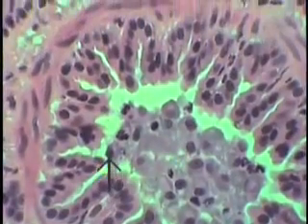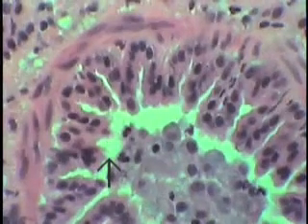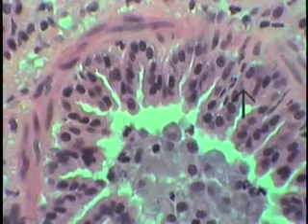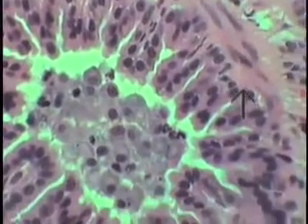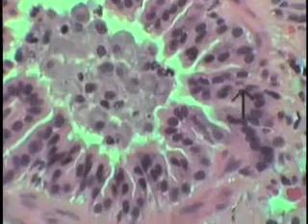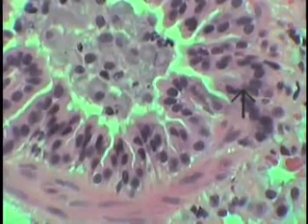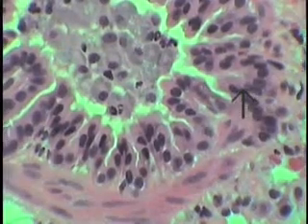No goblet cells are present in this particular case, so it's far enough down so the goblet cells have ceased to make their appearance. And as mentioned previously, the goblet cells will now be replaced more or less, or their position taken, by a specialized secreting cell known as the Clara cell.